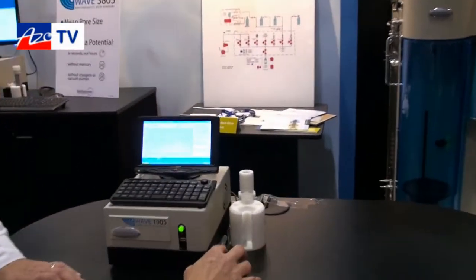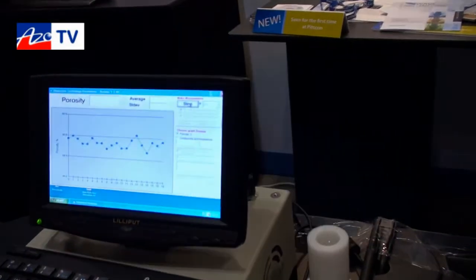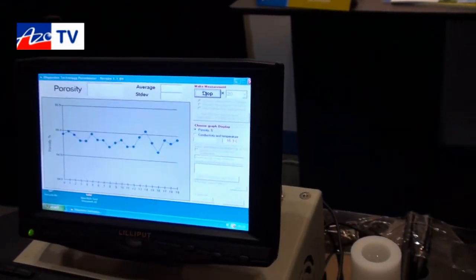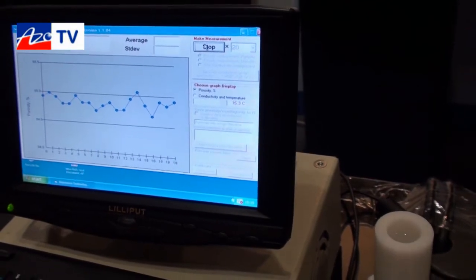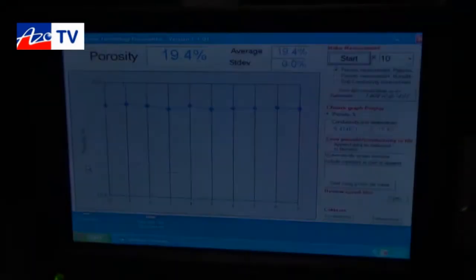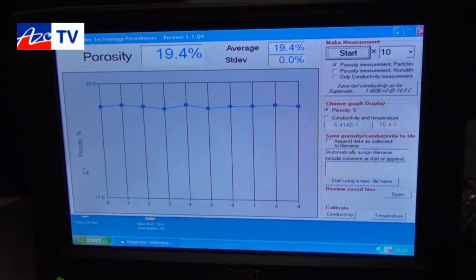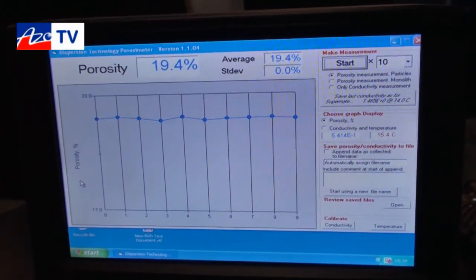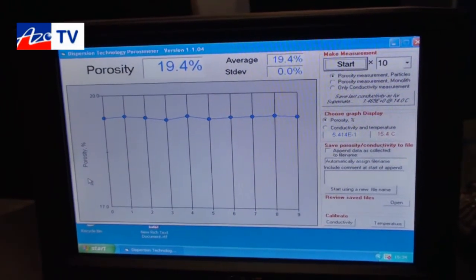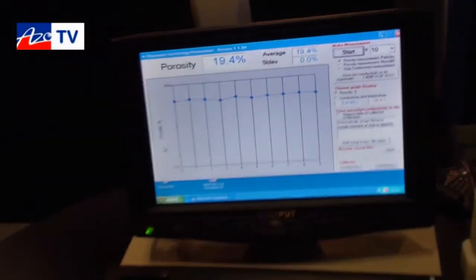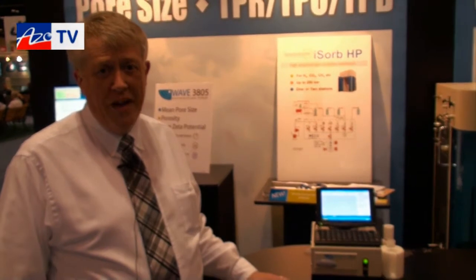I'll start the analysis now by clicking start, and as soon as the first measurement is made, the previous set of measurements will be deleted and the first new measurement will appear. It generally takes about 20 to 30 seconds per individual measurement, so about three to four minutes for a full run. Here are the results of ten replicate runs — you can see how very stable the result is. The standard deviation to one decimal place is effectively zero, with very tight measurement fluctuation. That repeatability is one of the things we really like about this technique.